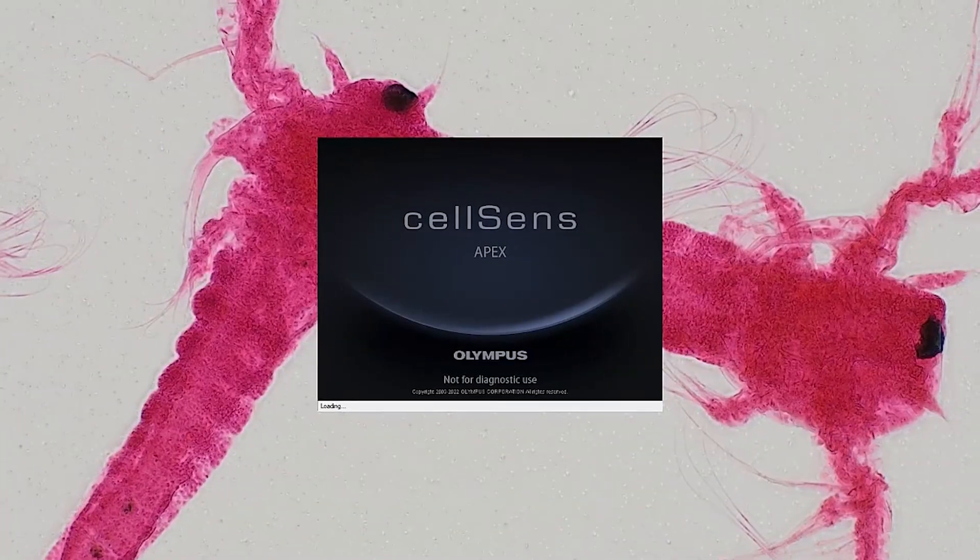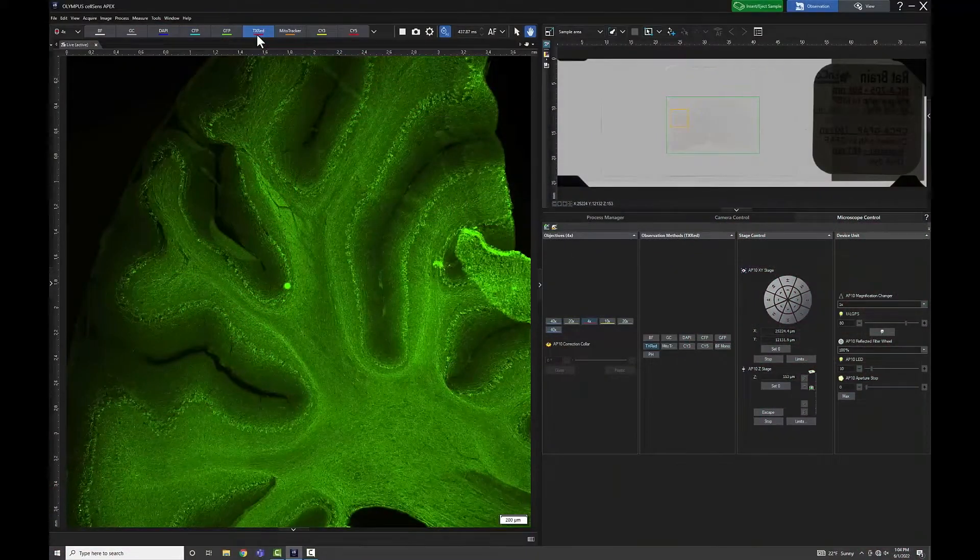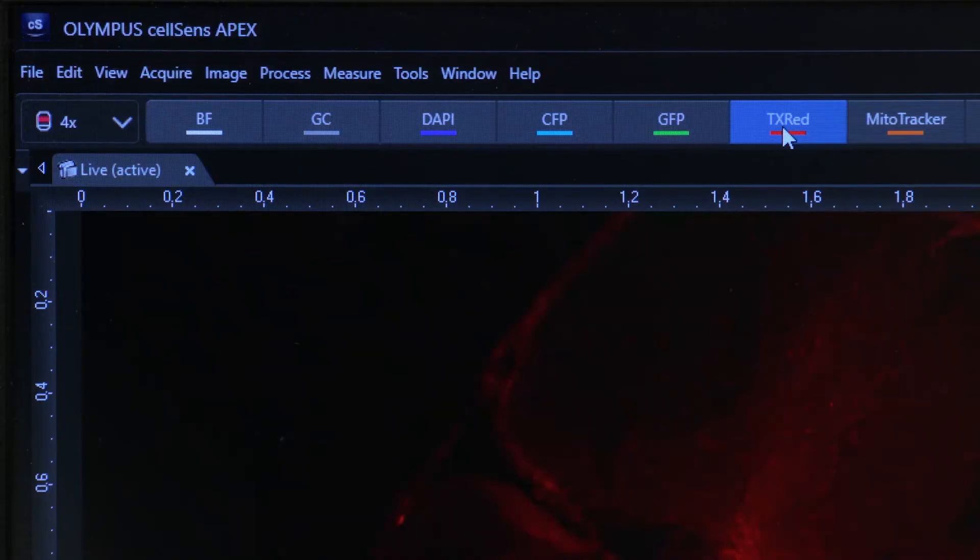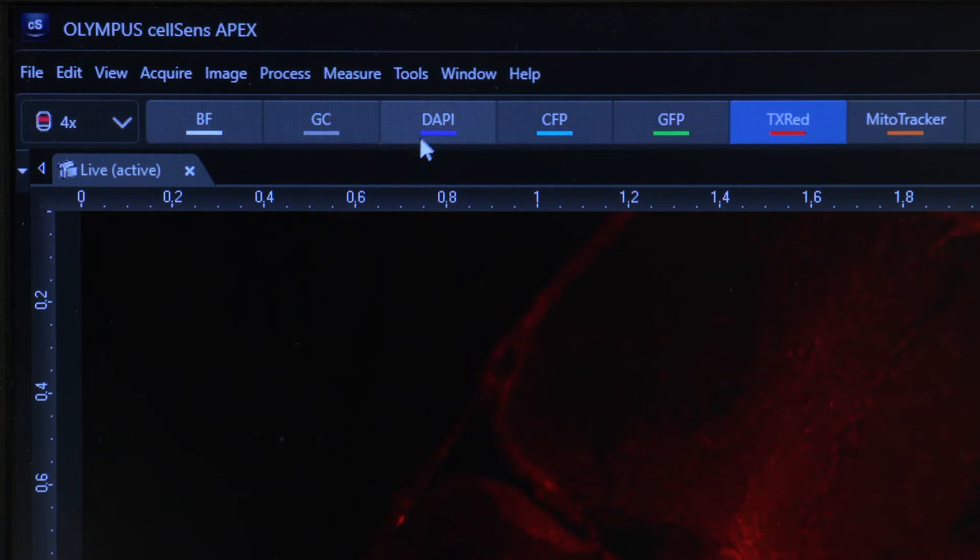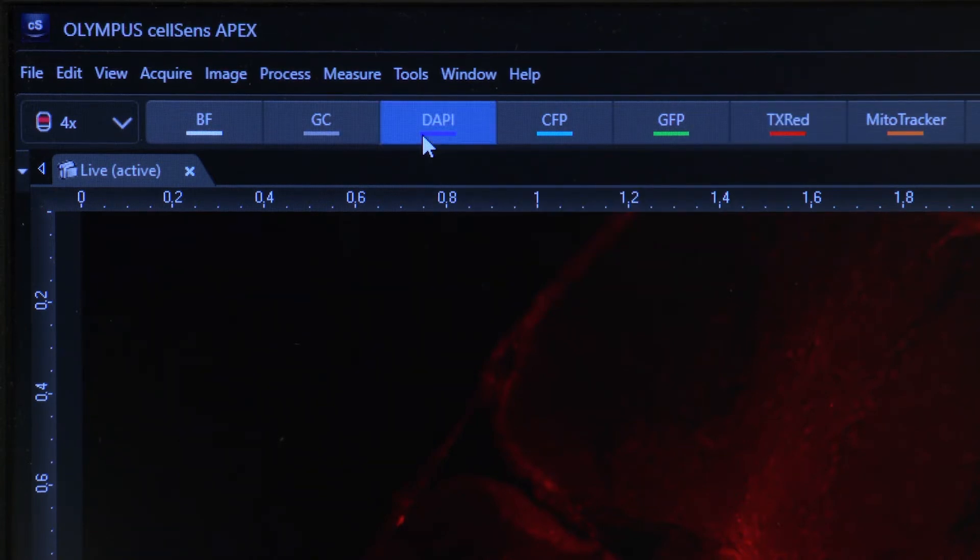Using CellSense APEX software, you can switch between modalities or filters with the touch of a button for efficient operation and ease of use.